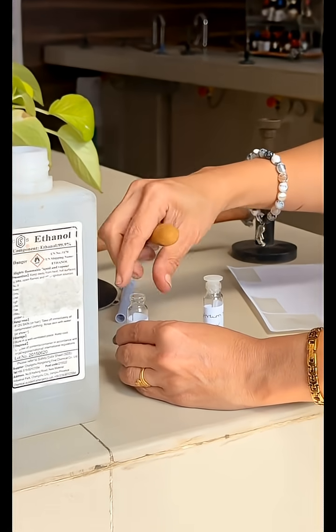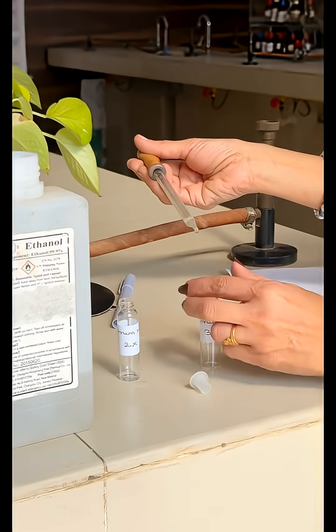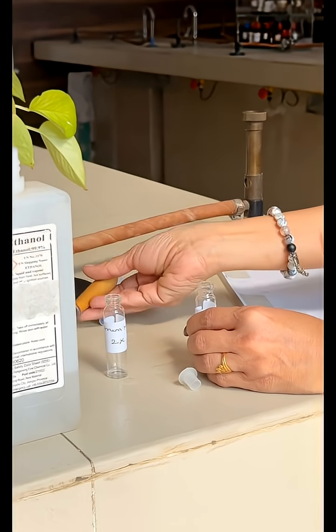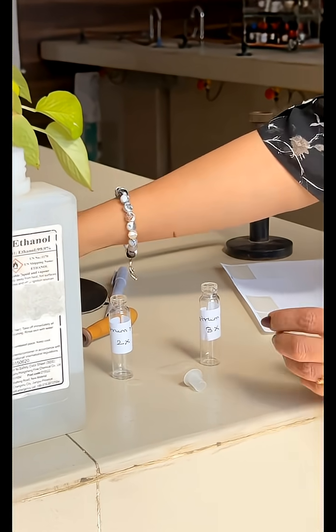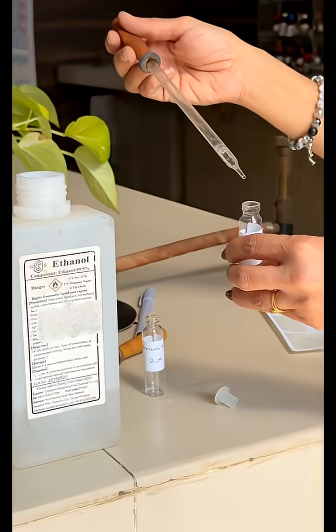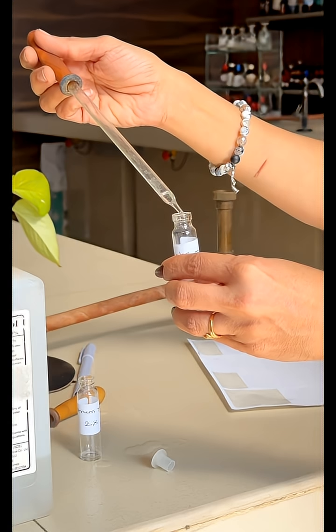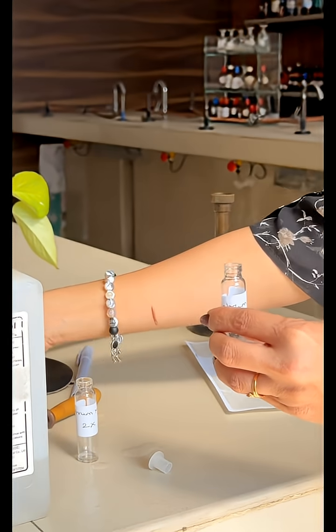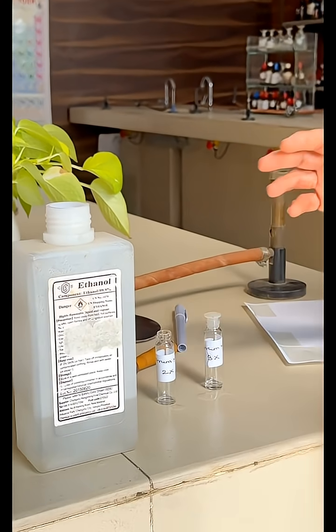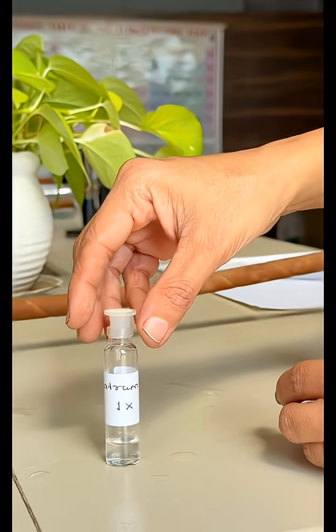For preparing 3x potency, label a glass vial with Natrum Mur 3x. As per the ratio again, take 1 drop of 2x potency and add 9 drops of dilute alcohol in the labelled glass vial. Now cork the vial and give 10 downward strokes on the succussion pad. In this way, we have prepared Natrum Mur 3x potency from Natrum Mur mother tincture, which is prepared by the old method.